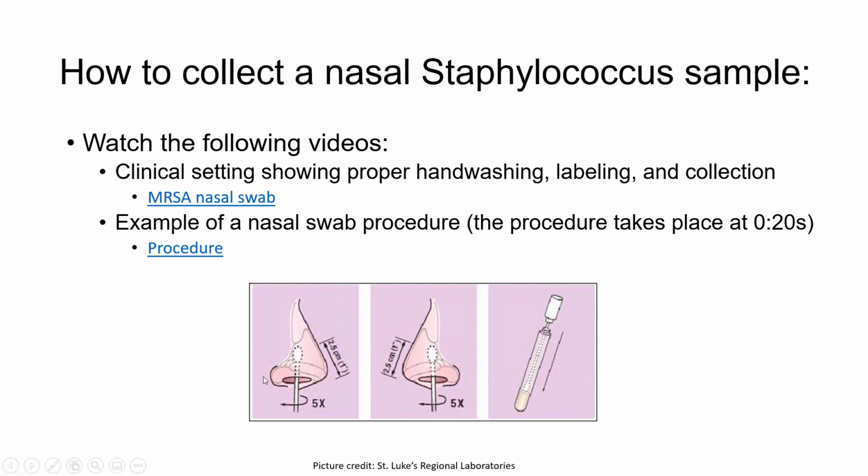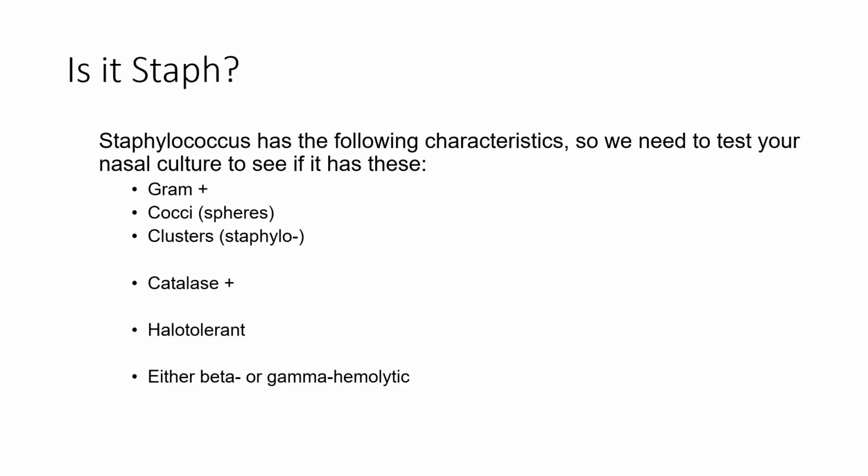samples, but staph is pretty common in the nose. And so, of course, if you had a staph infection somewhere else, you could swab that. But if you swabbed your own nose right now, you would find some staph. So that's what we would have done in the lab.